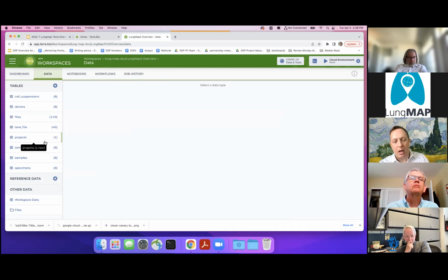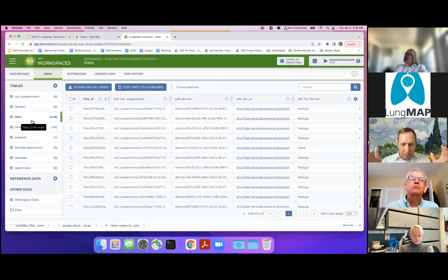Now, for instance, I came to this workspace and I want to run a pipeline, right? And then looking at the workflows, I know, okay, so my pipeline, I'm going to run, in this case, the Optimus pipeline. It doesn't have to be, you could upload your own pipeline. I would love to see your pipelines up here and be able to see what you're doing with it and sharing amongst each other. Like, I really just want people to share.